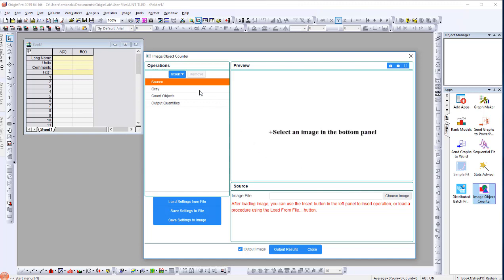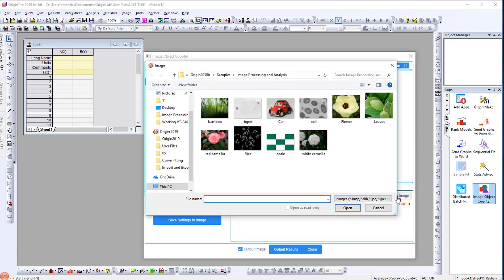There are four default operations listed: source, gray, count objects, and output quantities. Let's start by selecting the source operation. On the right panel, select Choose Image, and I will select cell from my folder to load the source image.